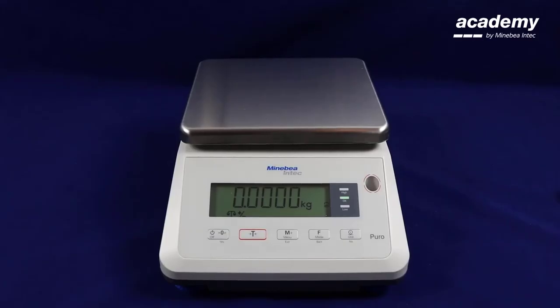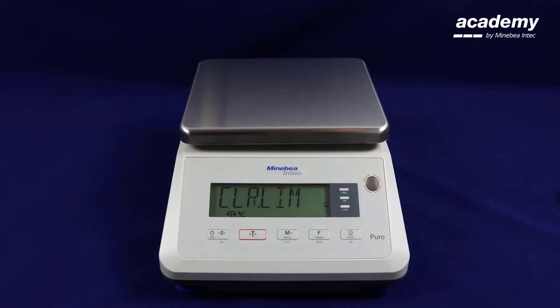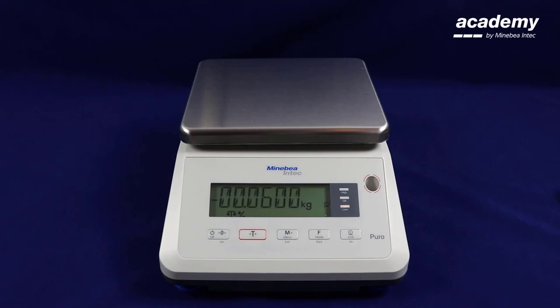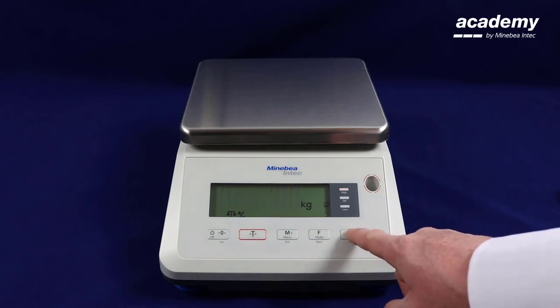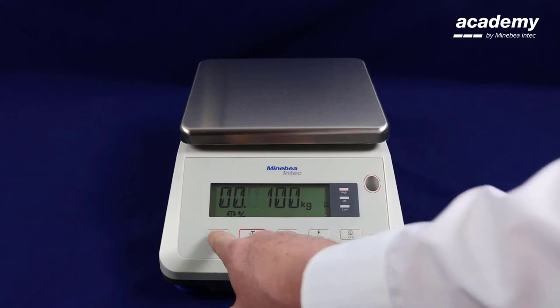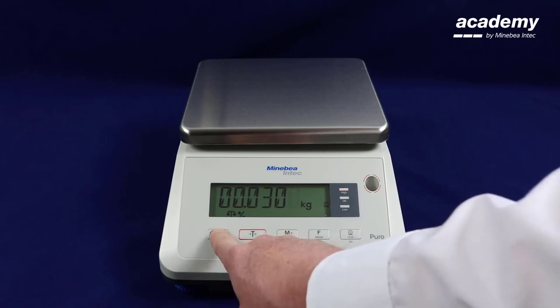We will now demonstrate zero check weighing. This is where you compare other samples with one reference sample. Again to start the application press and hold the function key to set your limits. For zero check weighing the lower limit has to be a minus number and the higher limit has to be a positive number. When you are happy with your upper tolerance press yes to accept.